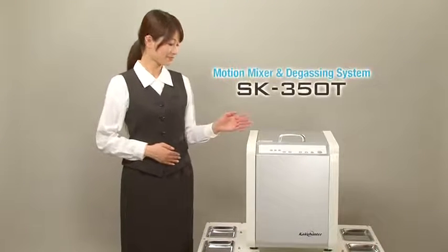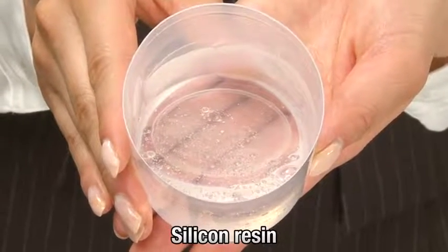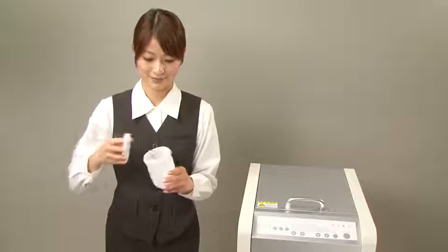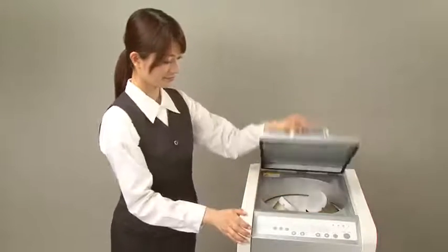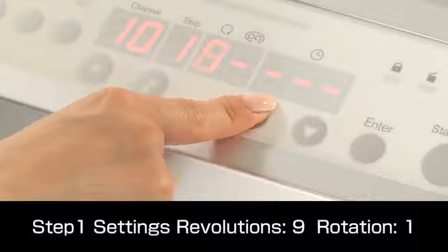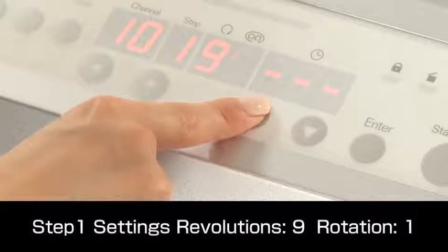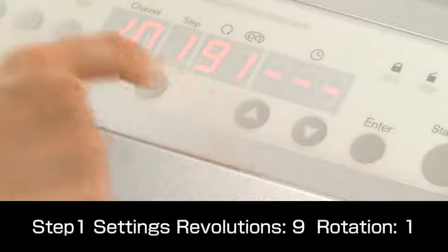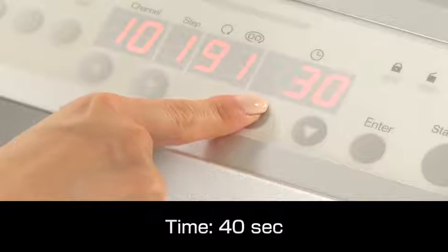Next, we will use the SK350T to degass silicon resin. The container with the material is set in the holder and the lid is closed. To just degass the resin, revolutions are set to speed level 9 and rotation to level 1. Degassing time is set to 40 seconds.